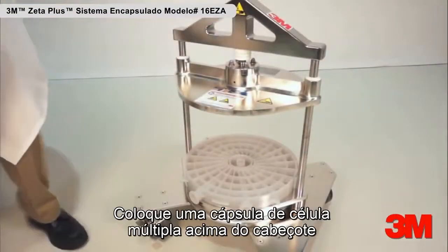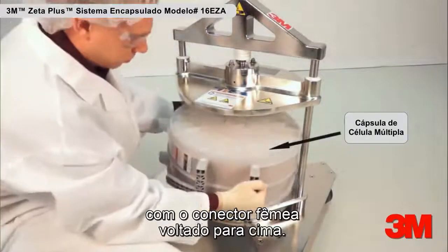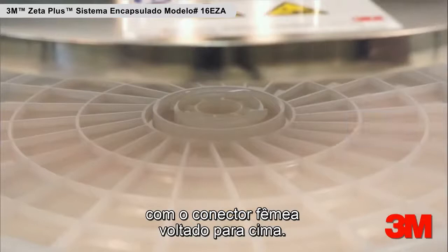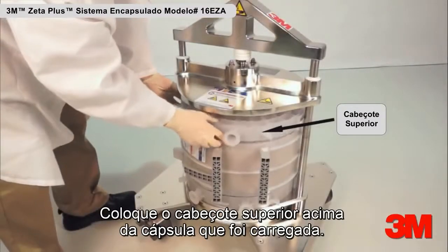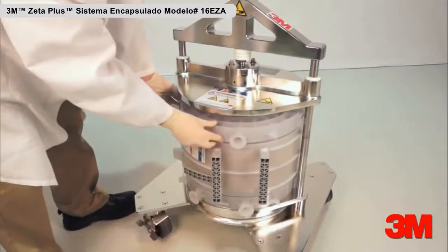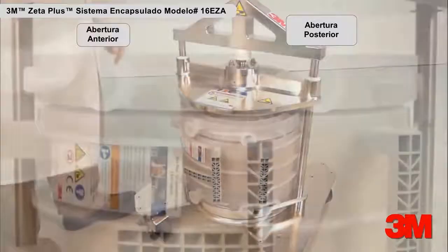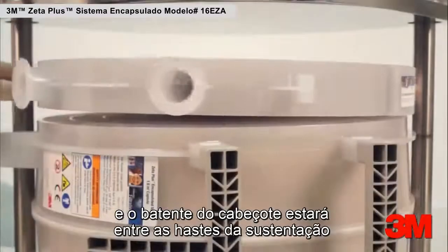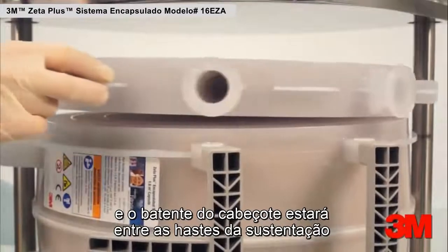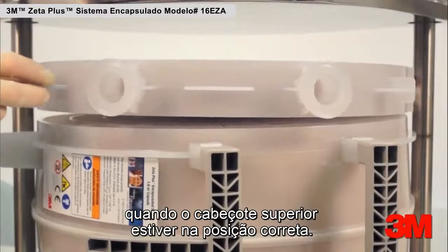Place one multi-cell capsule on top of the manifold with the female connector facing upward. Place the top manifold on top of the capsule that is loaded. The male connector of the top manifold will face downward. The upstream and downstream vents will face forward, and the manifold stops will be positioned between the support rods when the top manifold is in the correct orientation.